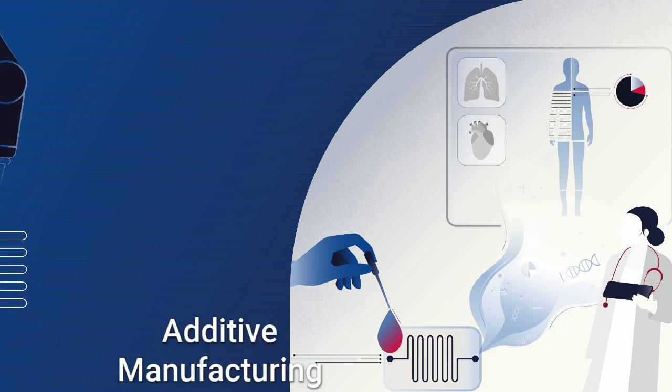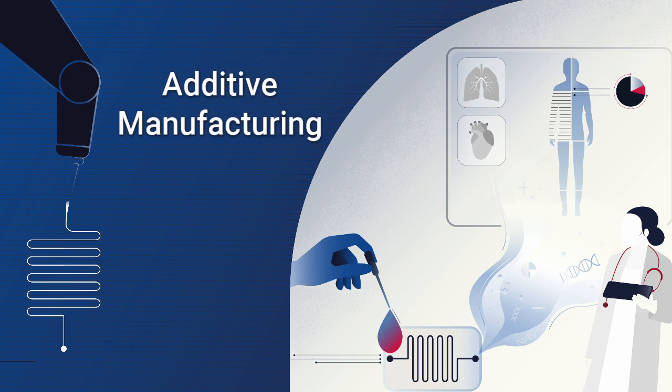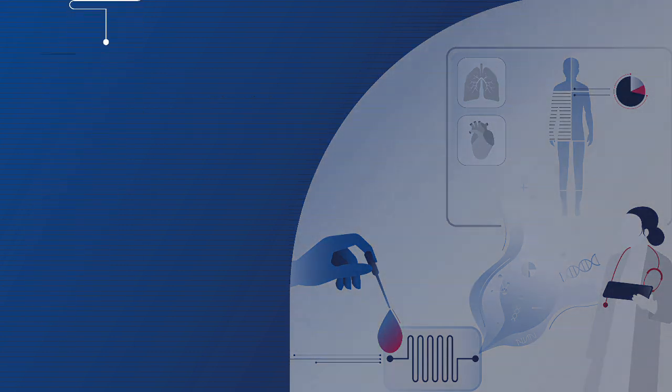However, manufacturing requirements for microfluidic MEMS exceed the current production capabilities of conventional techniques. Additive manufacturing, which consists of rapid multi-material printing with free-form structural capabilities, is a promising advance towards the further commercial deployment of BioMEMS.